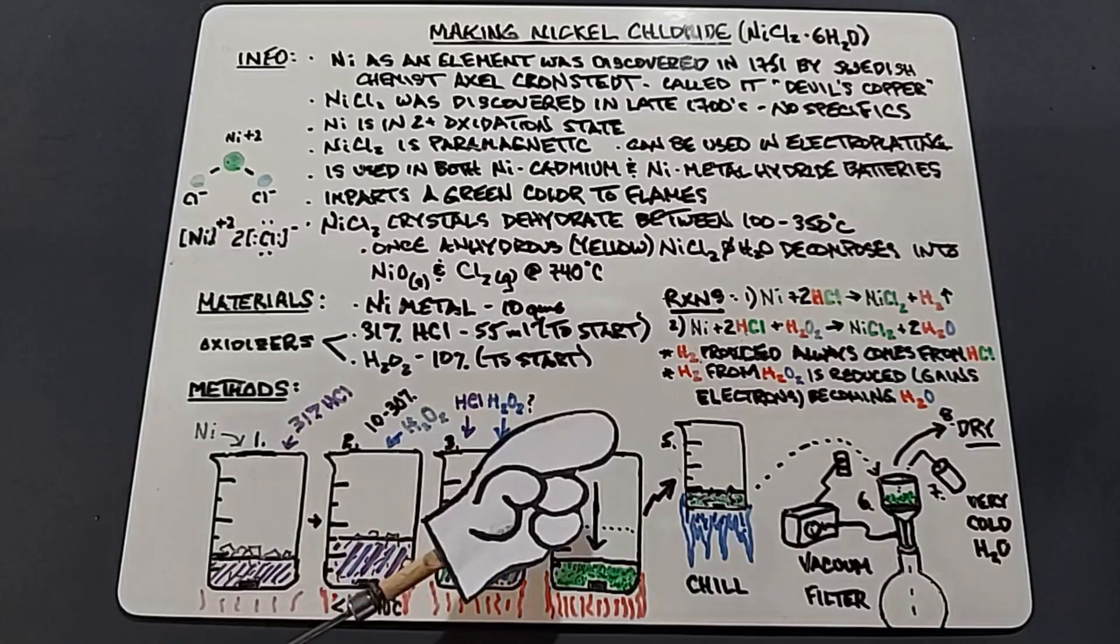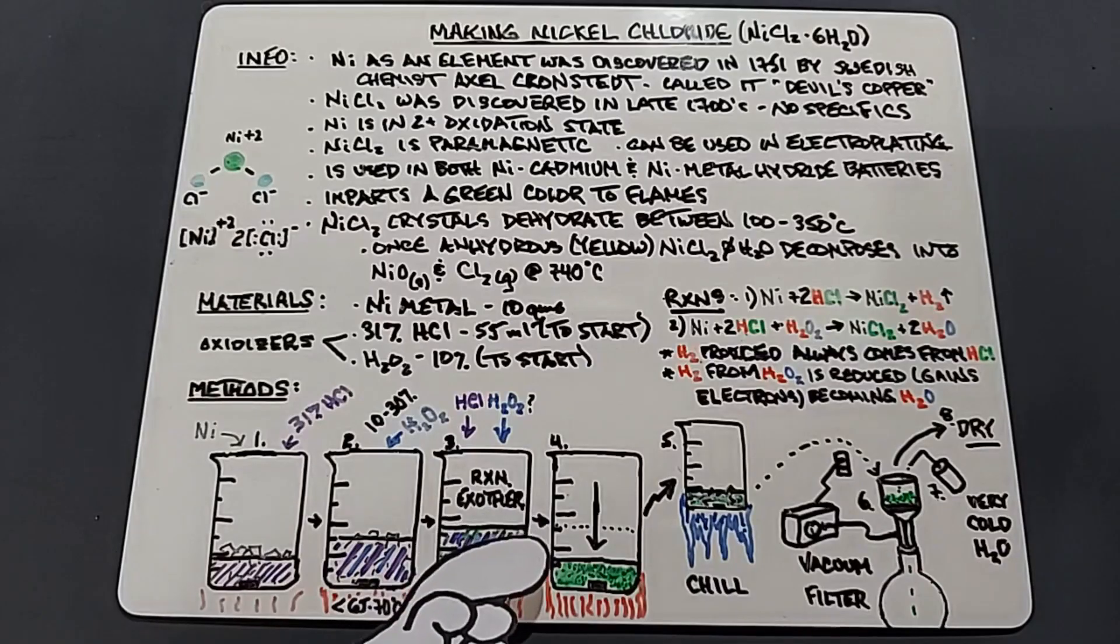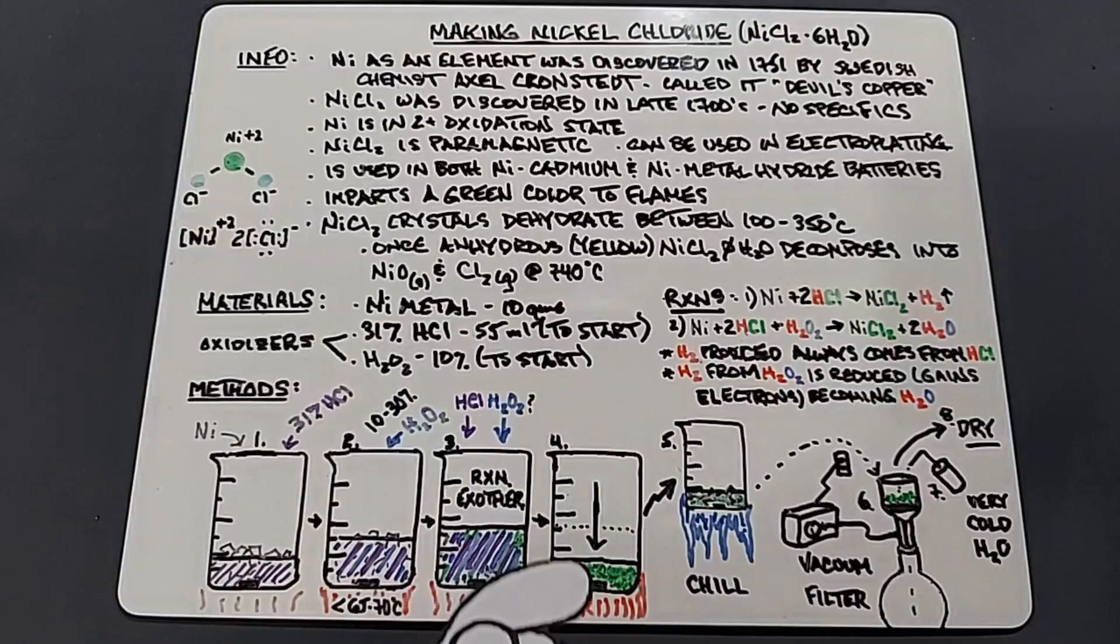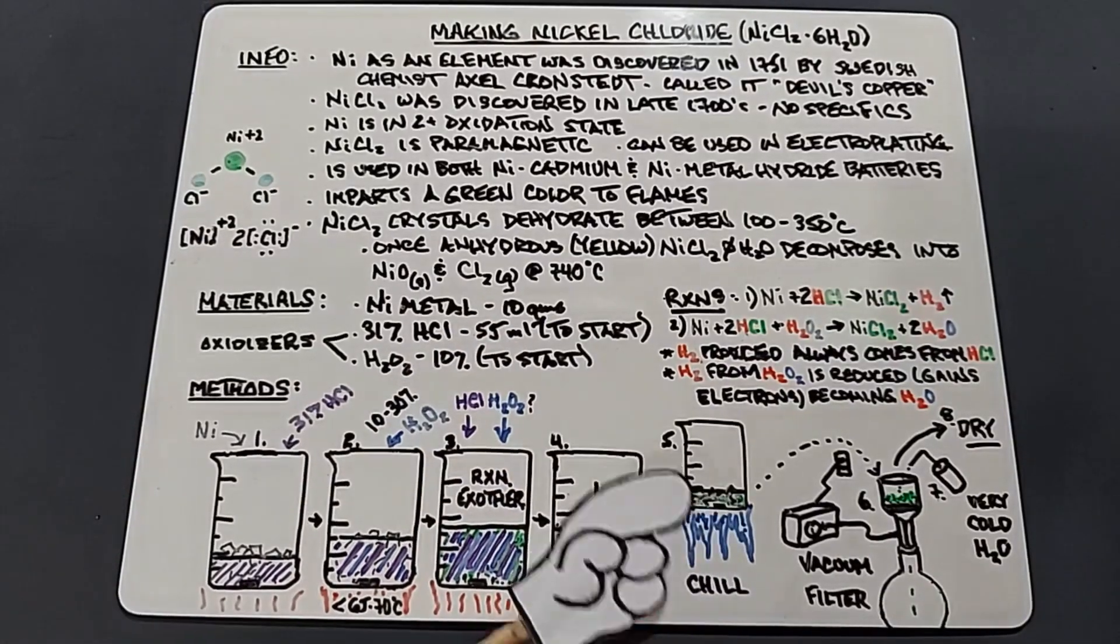Once all the nickel is dissolved, you want to heat it to get rid of as much water as you can. And once it gets down usually to about 10-15% of its original volume or so, I'll start to chill it to see if we can get crystals. If not, put it back on the heat and get rid of more water and chill it until crystals form. Once these crystals form, I plan on vacuum filtering them and using some very cold distilled water just to briefly wash them to get rid of any impurities, and then we dry them and weigh them.